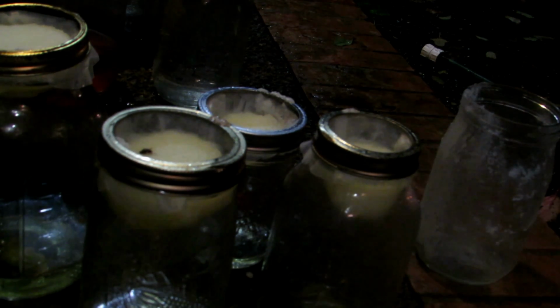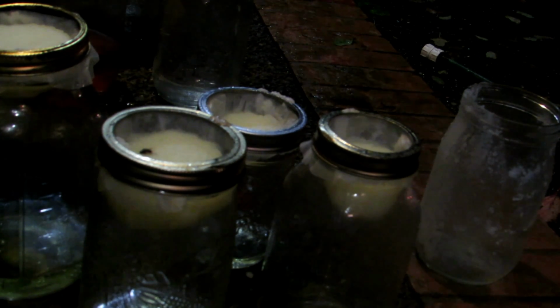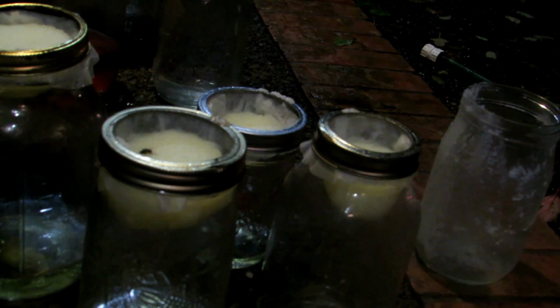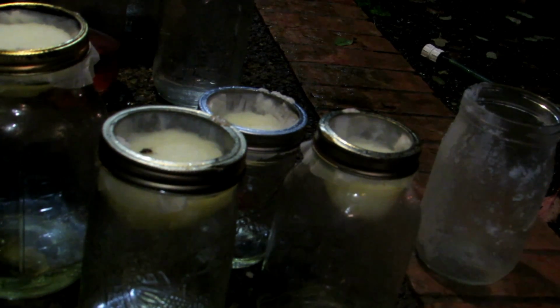So we'll put it all back into the jar and fill it with lots of water to dilute it, and filter once again just to dilute the acid more before drying it, because if we heat it up in a steel pan, it will start dissolving the steel pan, and the acid, when it's boiled off, will also release dangerous hydrogen chloride gas. So the first thing we definitely want to do is dilute this as much as possible. So I'll move it over to this jar, and then we'll dilute it.